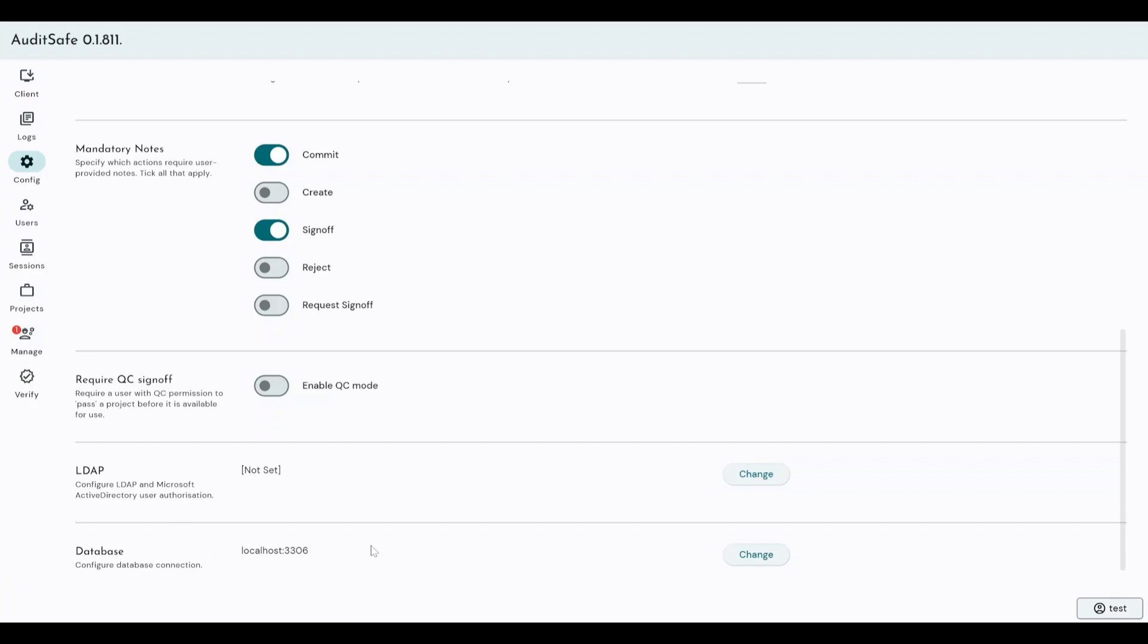Database is where the database is held that contains all the users, all their permissions and keeps track of all that information. Again, this is more of an admin setting. Ideally, this page should only be accessed by admins, typically your IT professional that's going to be administering the software, not your everyday analyst users.